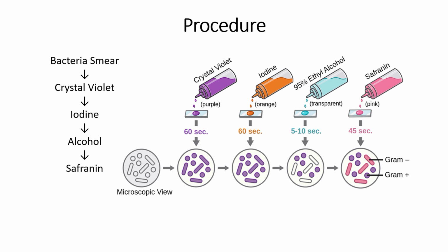Then, after decolorization, rinse the slide and apply safranin for approximately 45 seconds. And finally, wash the slide with water, dry it and observe it under the microscope. You will notice that some bacteria remain purple while others remain pink.